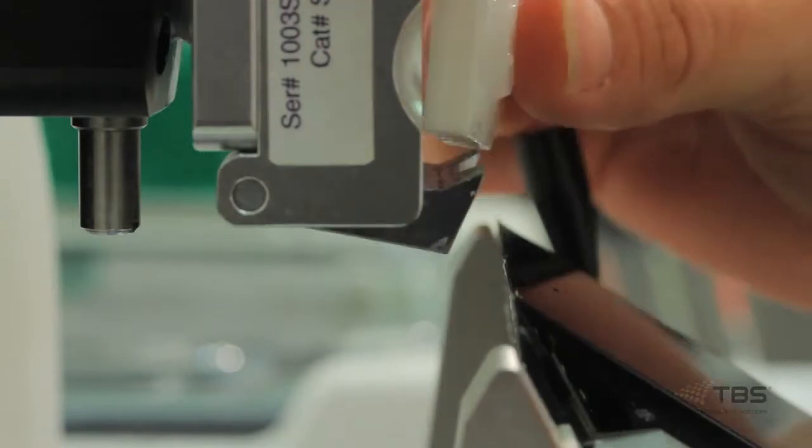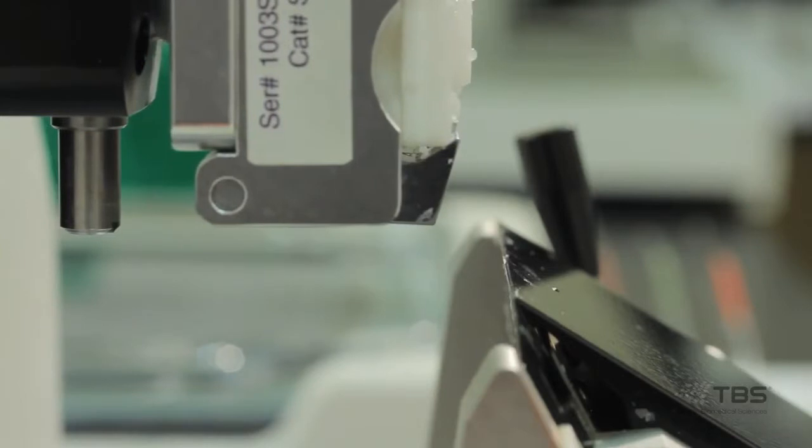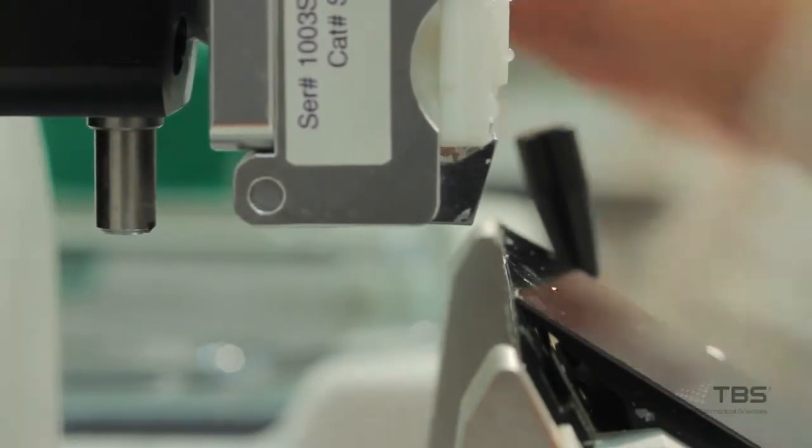With the push of a button after reinserting the block, the electronic memory will reposition the specimen back to the original location. Retraction can be turned on and off by the push of a button as well.